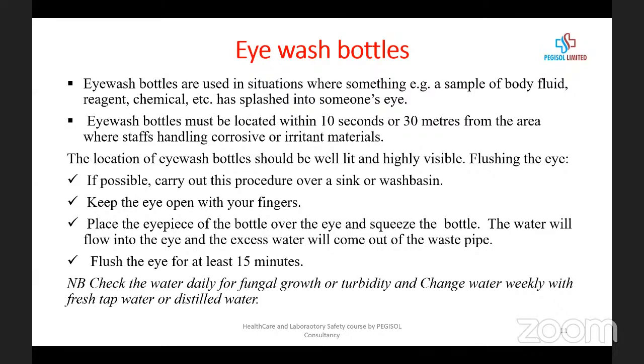So look at it again. This is for the eye wash station. This is just what I've explained. I said that the location of the eye wash bottle should be well lit and highly visible. So flushing the eye, if possible, carry out the procedures over a sink or a wash basin.